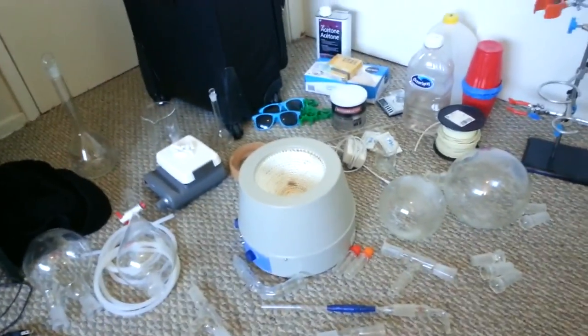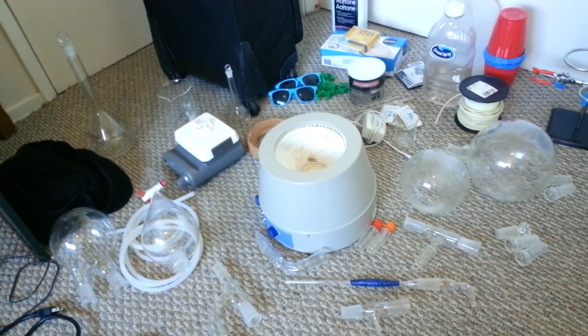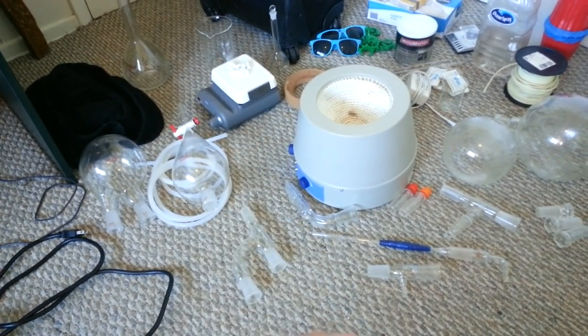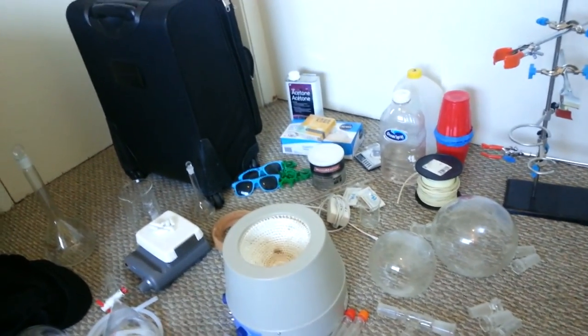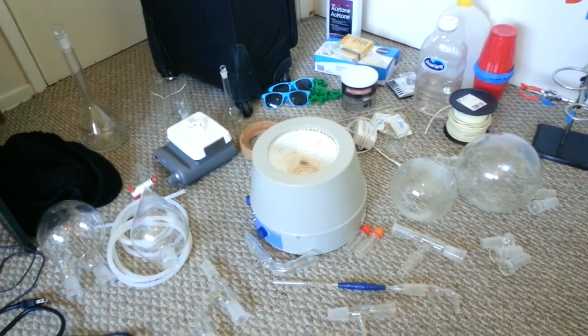That's pretty much everything — I cannot think of anything else. That's all the stuff I have needed so far. As far as price goes, I ordered all this stuff online — I probably paid about six or seven hundred dollars total. The heating mantle was one of the big ones at a little over $200. The stirring plate was something like $100 to $150. Surprisingly, the stand was $70. Round bottom flasks are like $30. I ordered this stuff from China, but as far as quality goes it works pretty well, so I'm not too worried about where it came from. If you're setting up your lab, this is the basics that you need to have — we'll start using it in other videos. Hope you enjoyed.